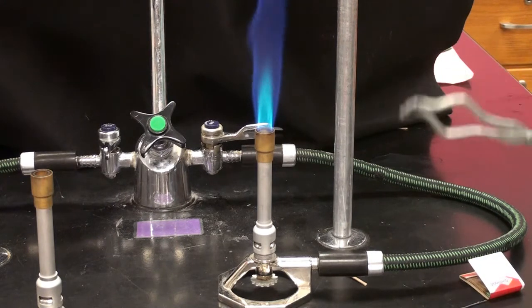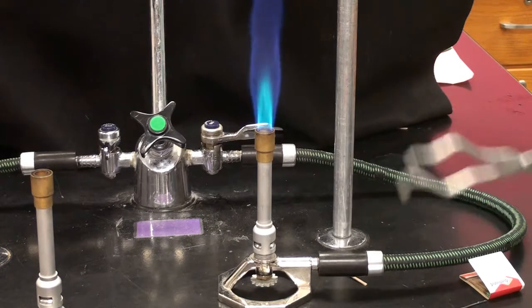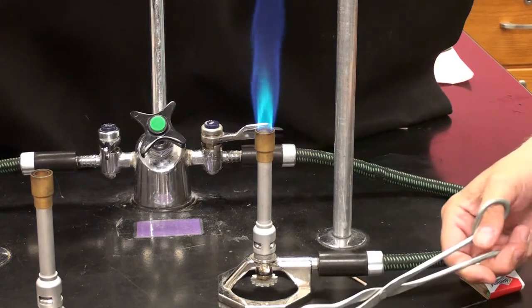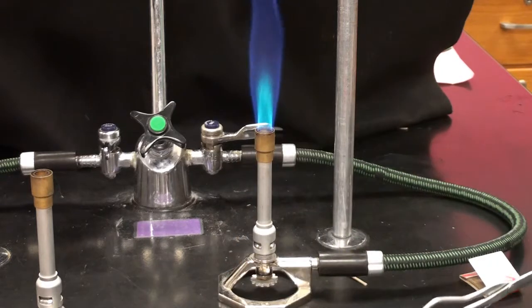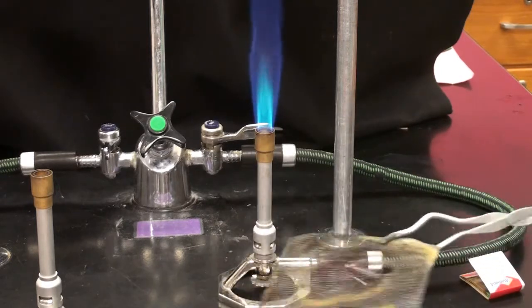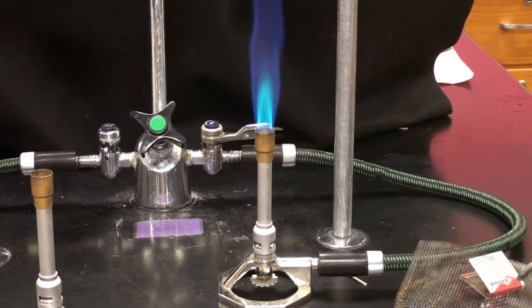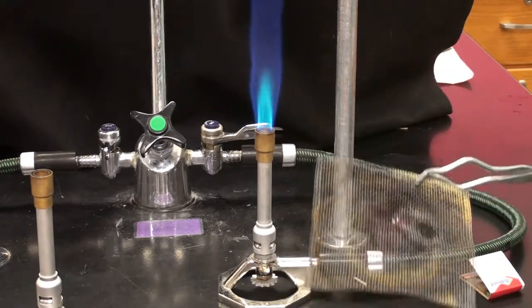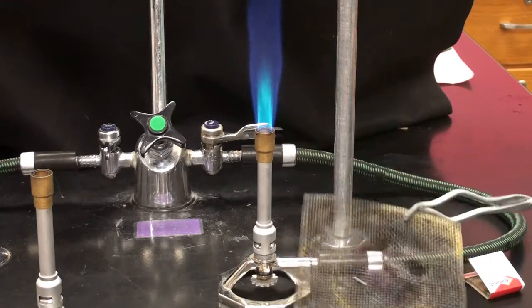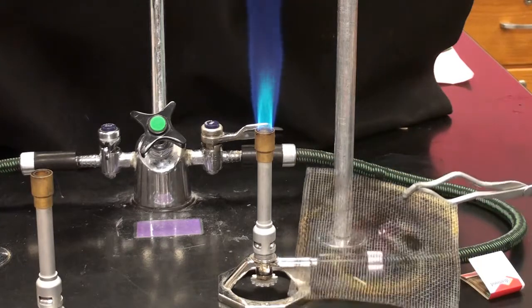The easiest way to get burned when you're using a Bunsen burner is to pick up something you've already been using. Like I would never pick up this piece of screen over here with my hands. Why? Because I've already had it in the flame. That's how most people get burned. They don't get burned by touching the flame. They get burned by touching something that they've already used in the flame. So you have to be careful about that.